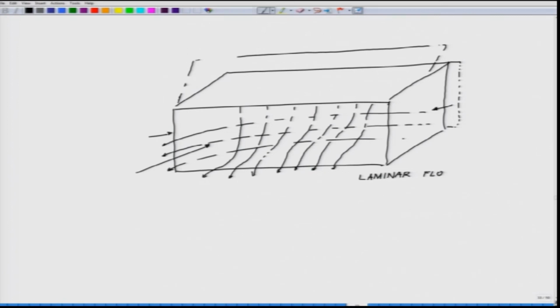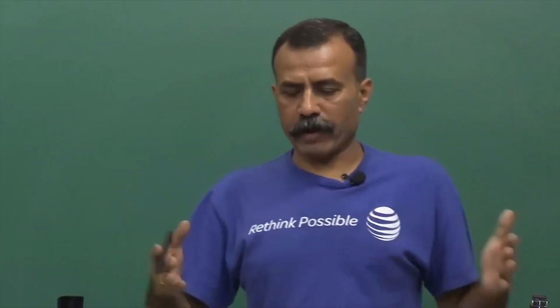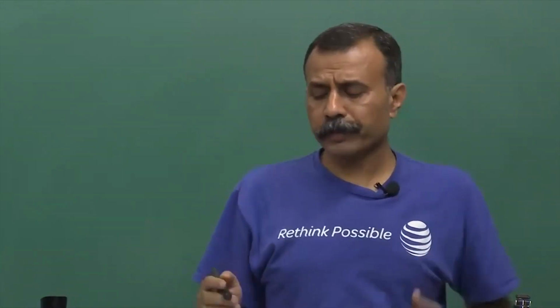and all the laminar flow hoods could be either vertical or horizontal. The vertical ones have an additional attachment at the top, whereas the horizontal ones have it on the sides or on the back, mostly on the back.